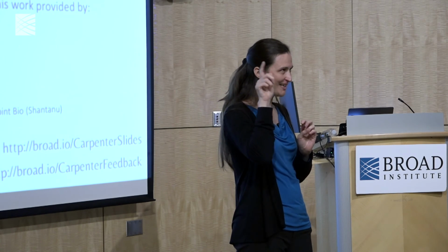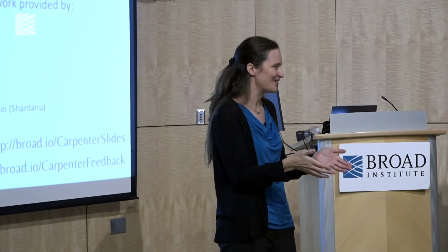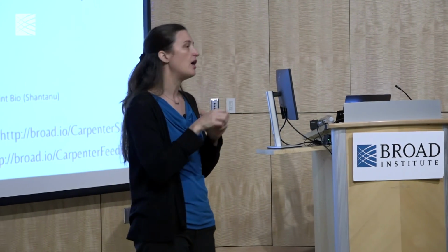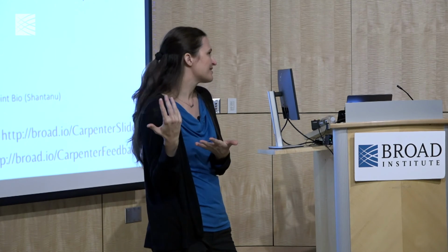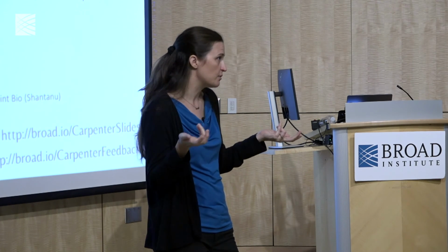So hopefully everyone can hear the asterisk in my voice where I'm saying, ideally, the compounds that work nicely in cells in a dish are instantly translatable to humans. In reality, there's all kinds of reasons why that relationship might not hold. Not the least of which is because you have to pick a cell type to do this experiment in. And as we saw in psychiatric disorders, we can find that phenotype in fibroblasts, not the right cell type as far as you would expect, and yet we could find a phenotype showing what's wrong in that disorder.